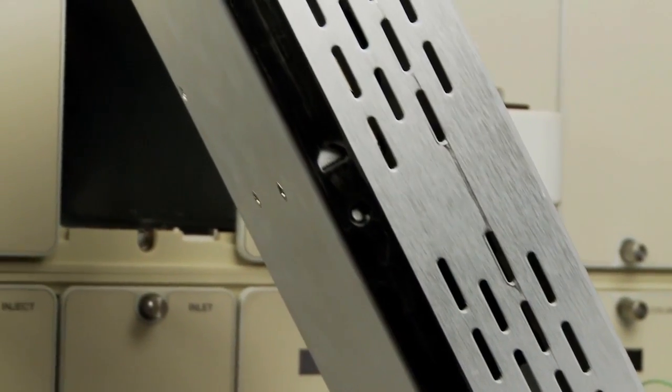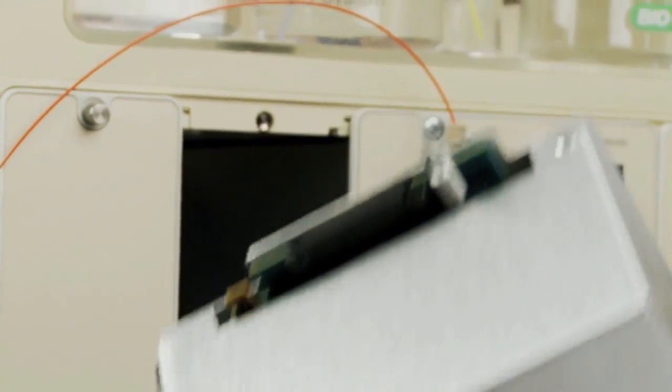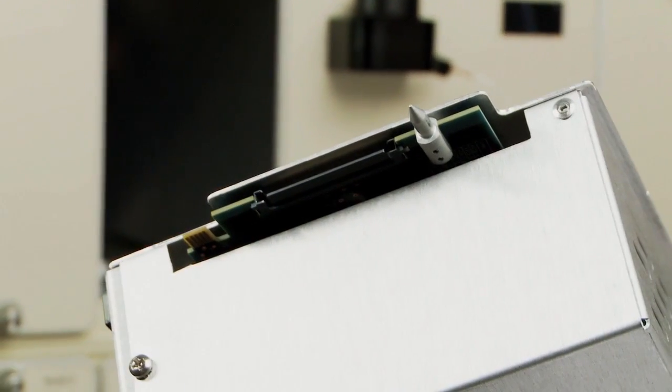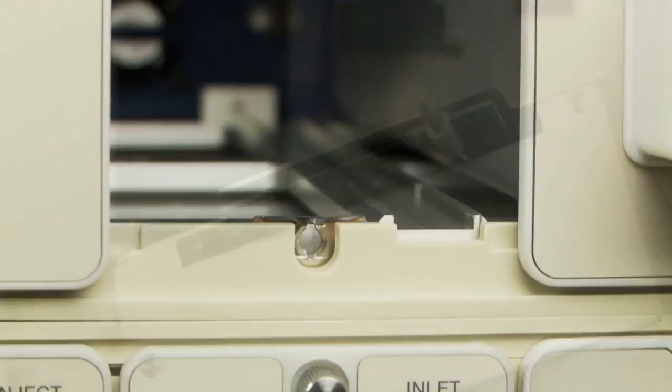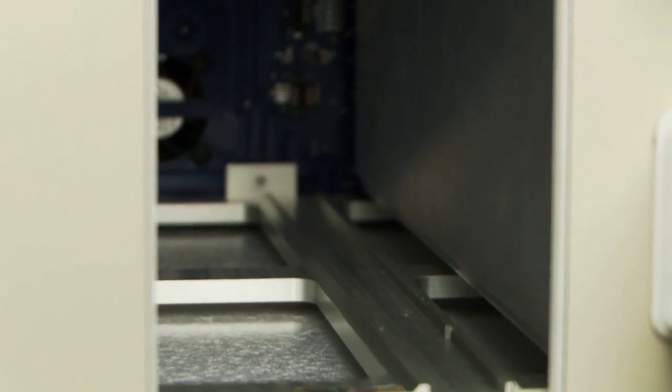Unpack the new module. Align the module with the open bay. Each module can be installed in only one orientation. Ensure the rail on the right underside of the module aligns with the track on the right side of the empty bay.